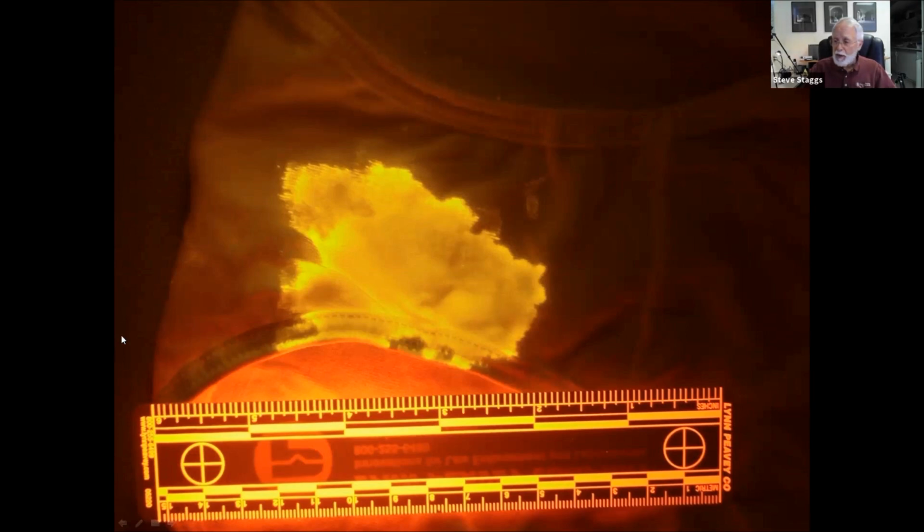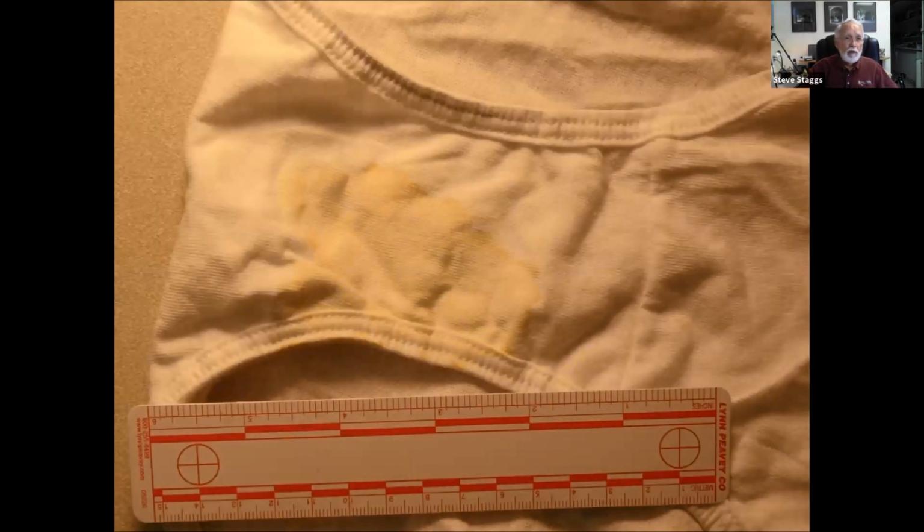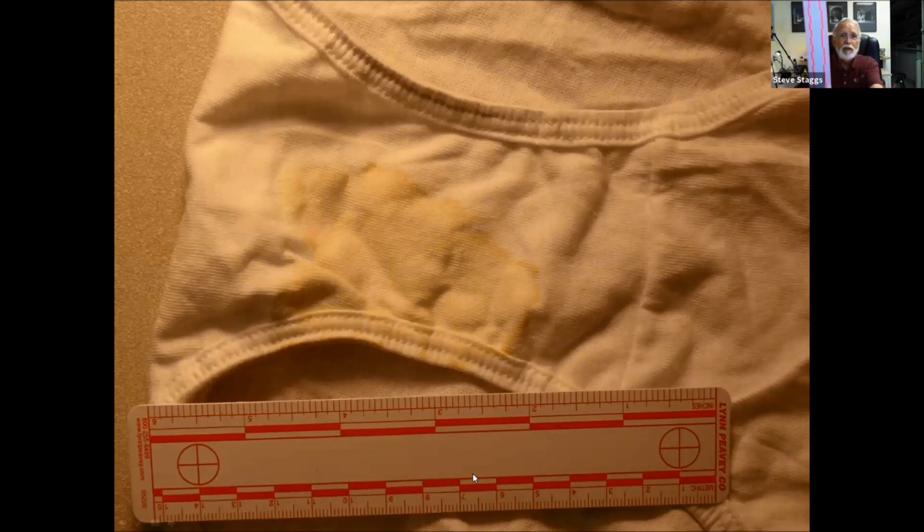Now notice that I have used a special scale. If we go back to just the white light photograph, you can see it's a fluorescent scale. So I have a fluorescent scale here. We're using the alternate light source. You need the scale to actually show up. So this one glows. So that's the alternate light source.